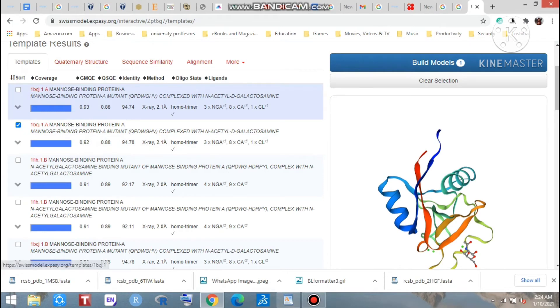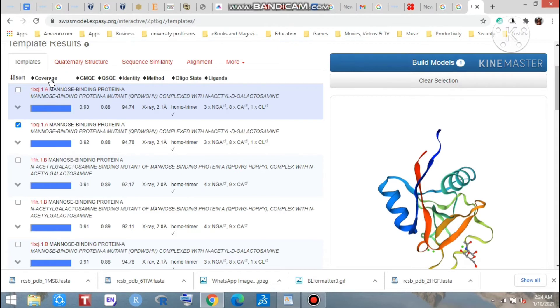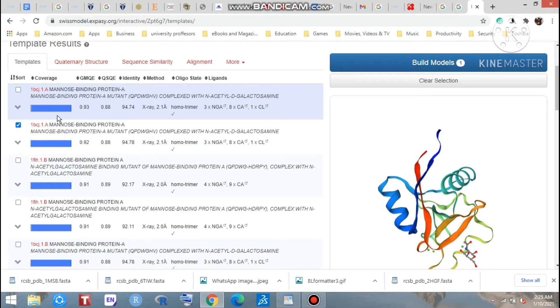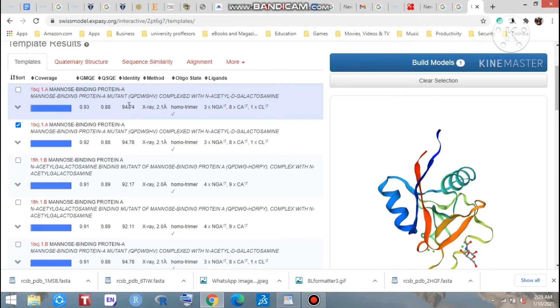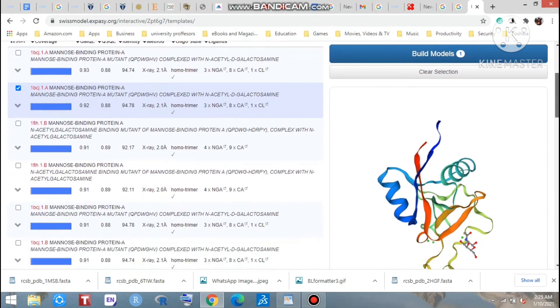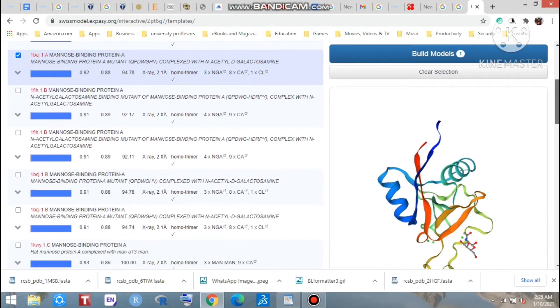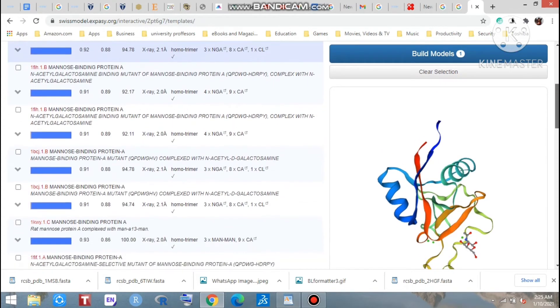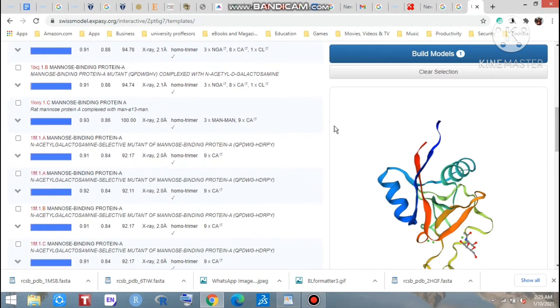Look at the coverage. What is coverage? Actually, the coverage is called query coverage, that means how much of our query has been covered in this entire sequence. Here you can see that is good. And what you will select? You can see the identity. The important thing is identity. Look at that, that is 94.74, that is 94.78. You can see several ones which is best.